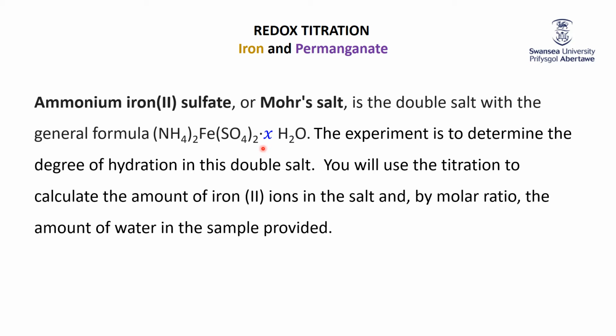Now, I should warn you that if you go look up Mohr's salt on the web, you'll find a certain value of X that I won't tell you because I don't really want you looking it up. But so that it's a little bit harder for you, I have partially changed this value of X. Okay, so X in this experiment is not going to be the value you could look up. It's going to be a different value.